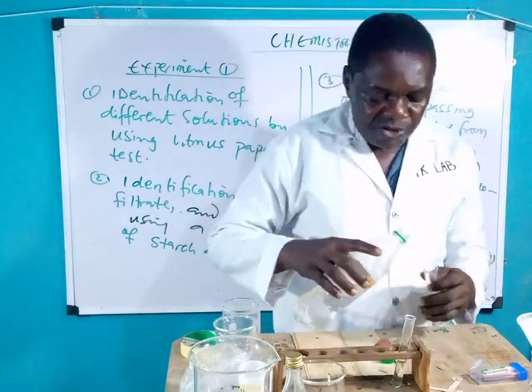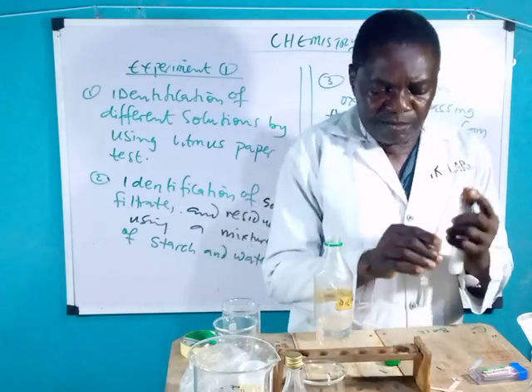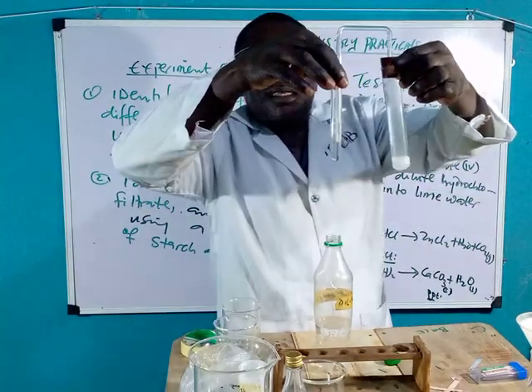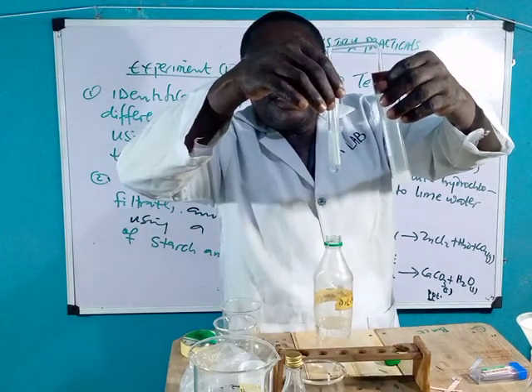You see the vigorous effervescence we are talking about. You can see the bubbles, and the color is gradually changing to cloudy. You can see it like cloud.